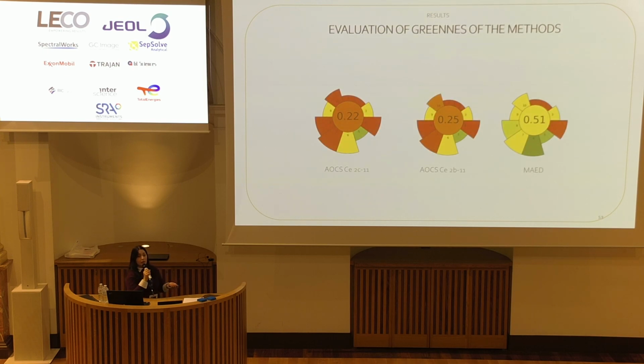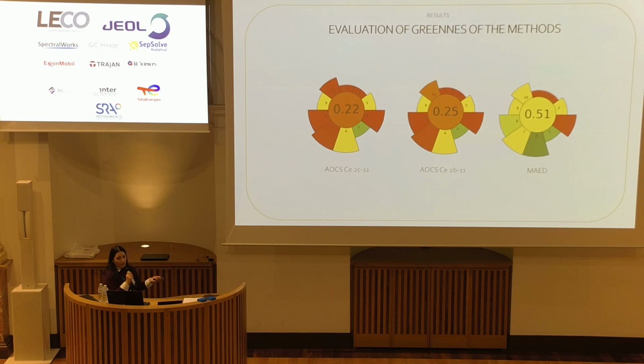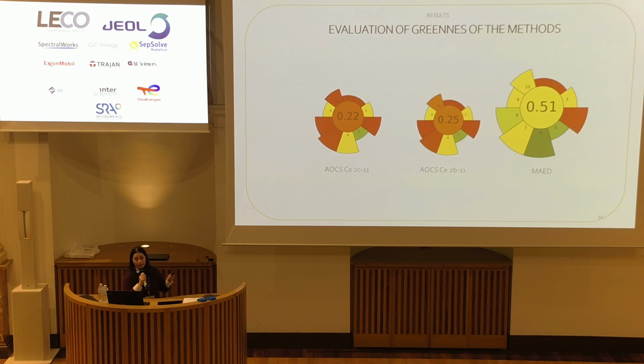To conclude the part of results, we also evaluated the greenness of the sample preparation methods, and basically the official methods received the lowest score, while the MAED the highest. And a little note here is that this metric that we used didn't take into account the use and the benefits of GC times GC.